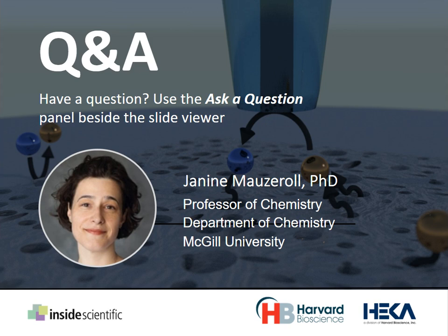Other options too is to use micropipettes in combination with ICP OES, inductively coupled optical emission spectrometry. There, it's not SECM per se, but you're collecting the solution and sending it to the ICP afterwards. So it's a complicated question, and it requires the development of a specialized probe for you to do it.